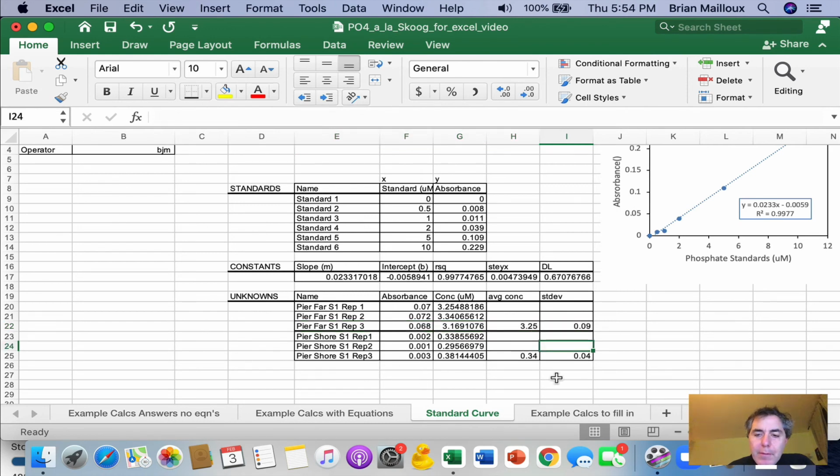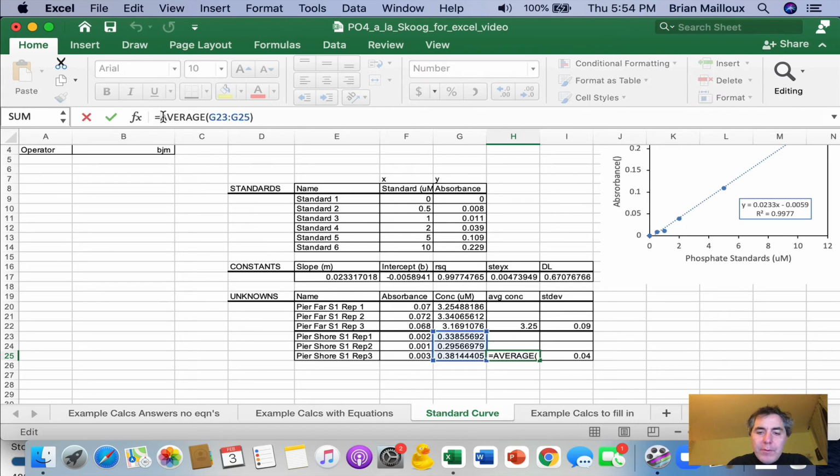So now we have these 3. But now, if you look quickly, our value is less than our detection limit. So we are in a bit of a pickle here. What you'd actually do to make this work much better is, this is actually non-detect. We call this non-detect. And what I do is I put in an if statement. So now we can do equals if.